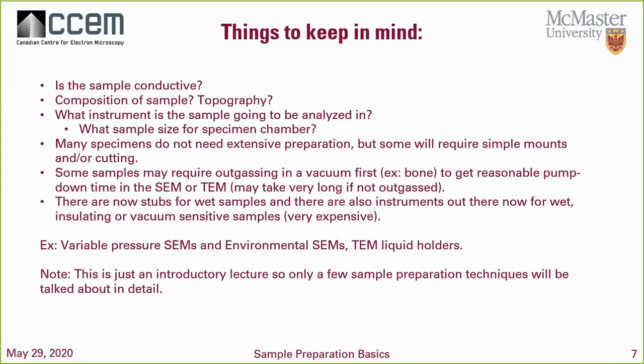But just to add to this point, some samples will require a reasonable pump time in these instruments so that you will be able to look at them. So for example, if you had something that's mounted on Bakelite, I know some Bakelite has some really bad contaminants there for some SEM vacuum. So if you have a variable pressure SEM, or low variable pressure SEM or environmental SEM or liquid holders, you might be able to get away with some wet samples or insulating samples or sensitive samples. But I just want you to keep in mind that these types of equipment are extremely expensive and not everyone can get to them.